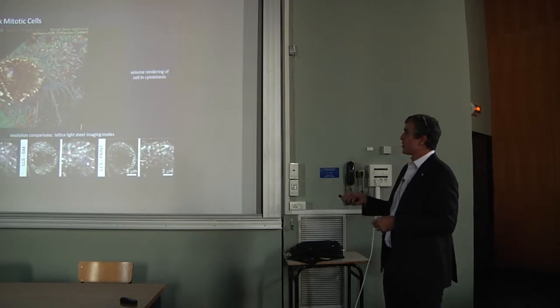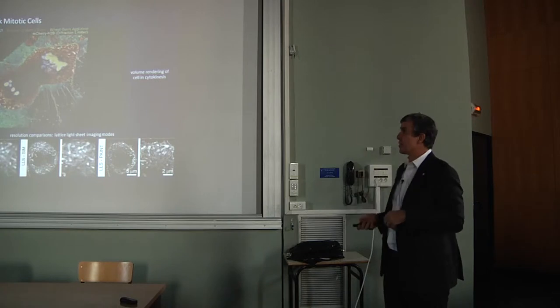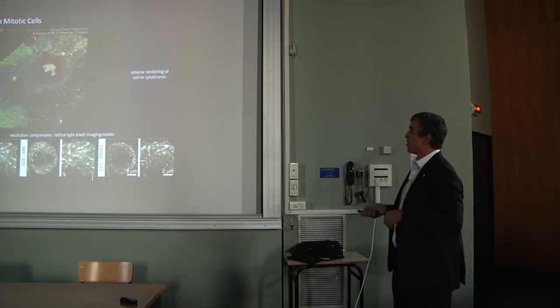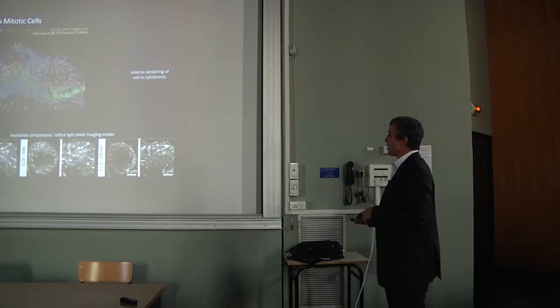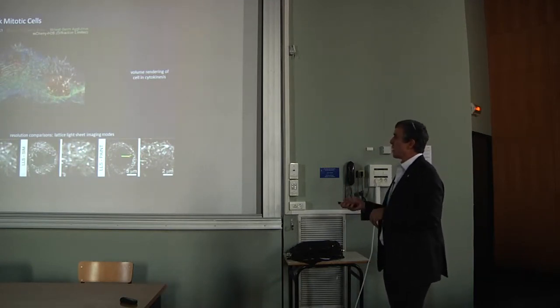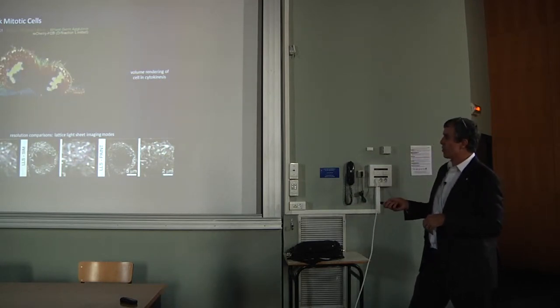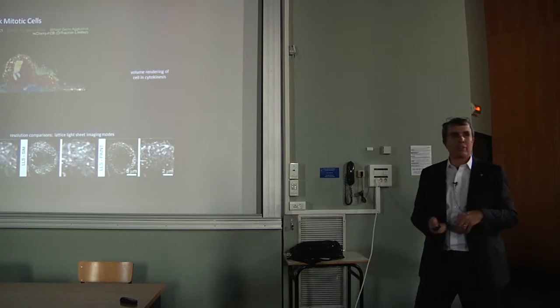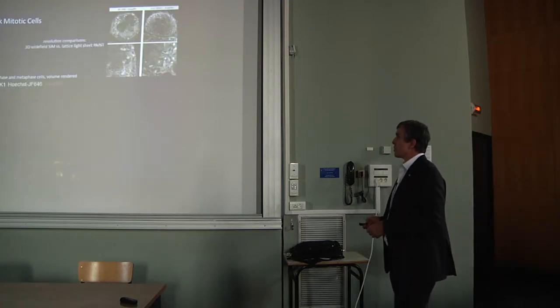Here are the retraction fibers. Here are these little fibrils that form when the membrane has to stick out as it reduces its volume, but to maintain surface area. And so this is 2-color imaging here. We can compare that to the other modes of this light sheet microscope I talked about earlier, and there's the clear resolution improvement by going to localization microscopy.